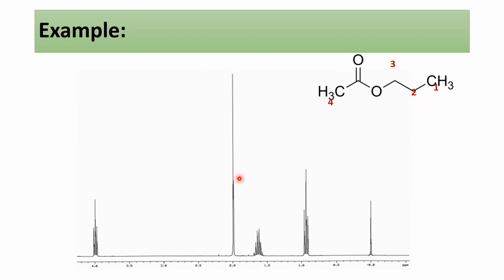All right. Let's start from the start. The first carbon, the first proton, would be assigned as 1. If I go into split, you'd have seen it even more. It is the furthest away from any electronegative group, so it'll be the most shielded.